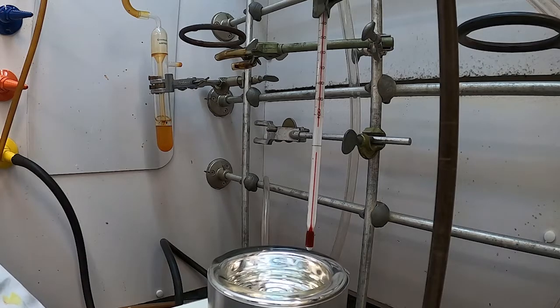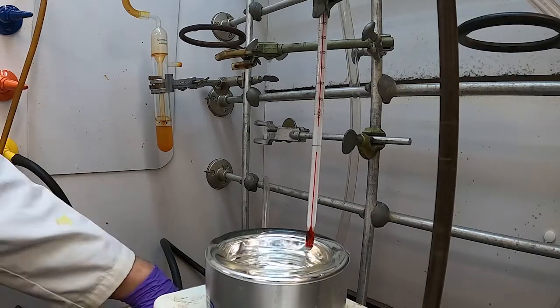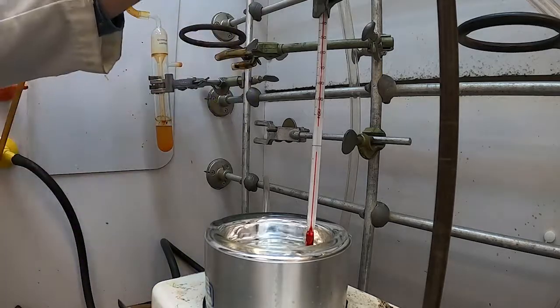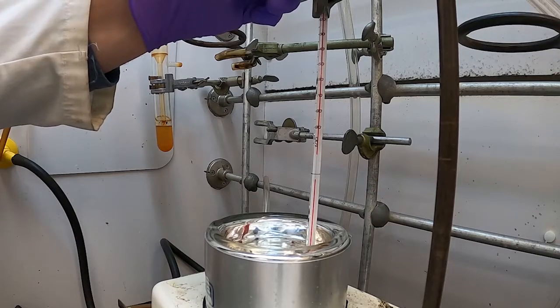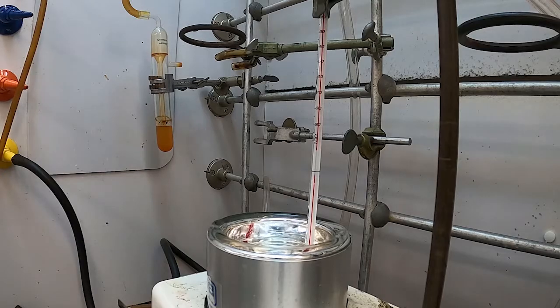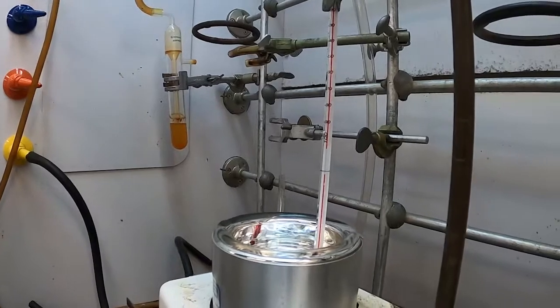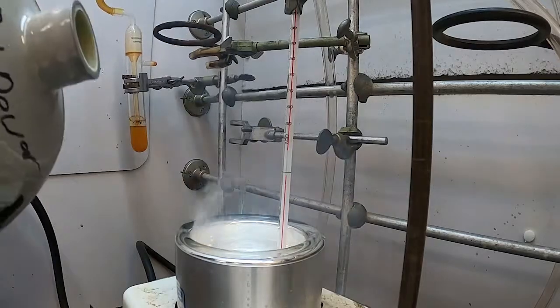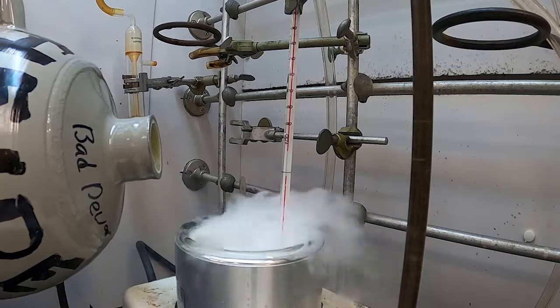So just like with any bath, we want to raise our bath to what we're cooling. In this case, I'm going to raise up this dewar a little bit, and then I'm actually going to lower the thermometer now. So touch the bottom and then just back off a little bit. And I've got nitrogen dewar. Start by just pouring out some of this cold vapor, I guess.